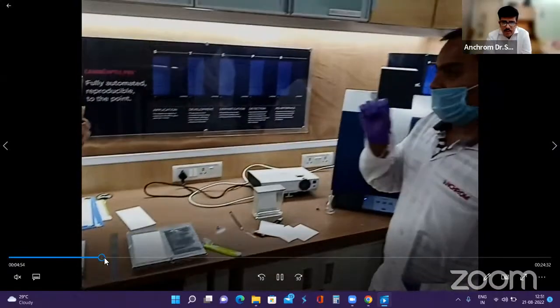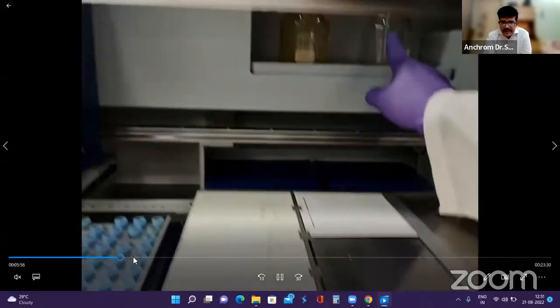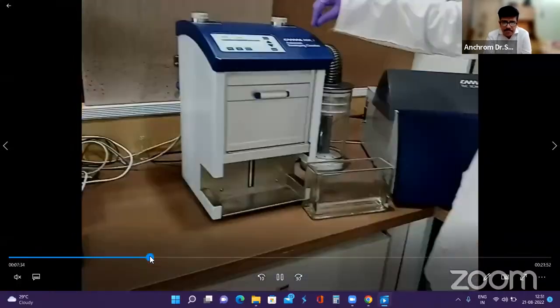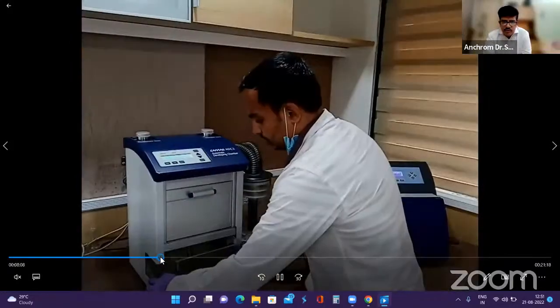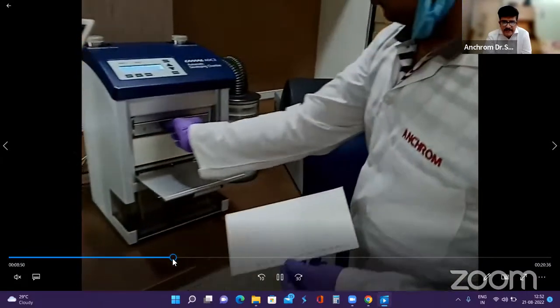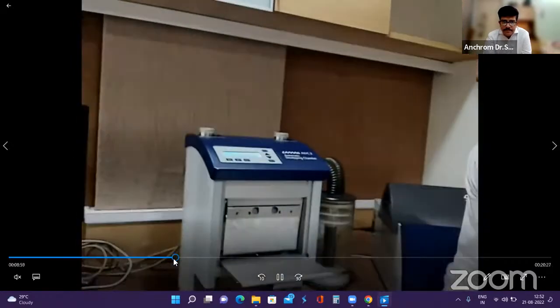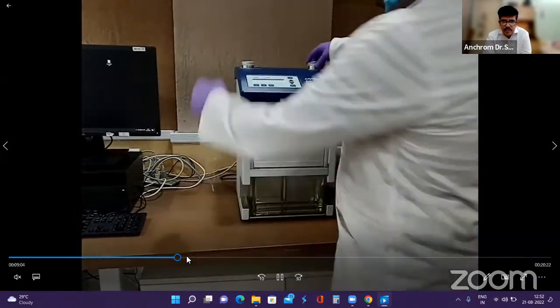Now, in case of an ATS4, he'll do the same job as told, but through the software. So he has placed the plate and applied it. There is a rinsing bottle and waste bottle, and the application happens with the help of this applicator, as we saw earlier. Now, this is the developing device where we do the development. Again, this is a module we have seen. It is placed like this, and the plate is placed inside. This is how we load the plate inside the ADC2, and we attach it over there. Now close the door of the ADC2 and give the command through the software.